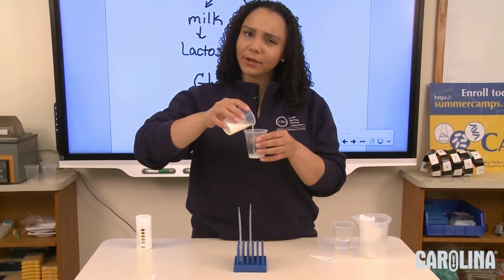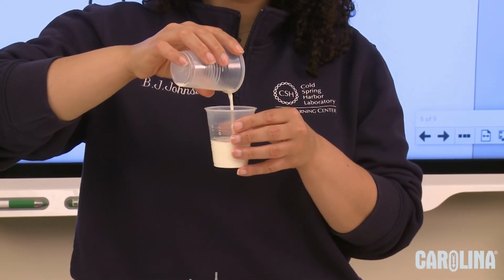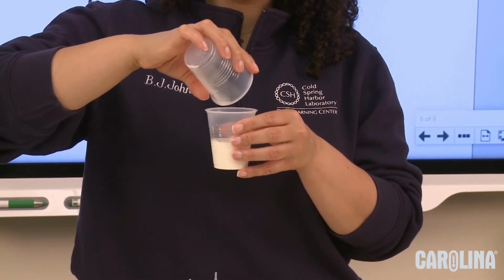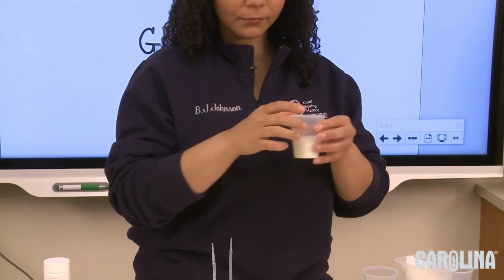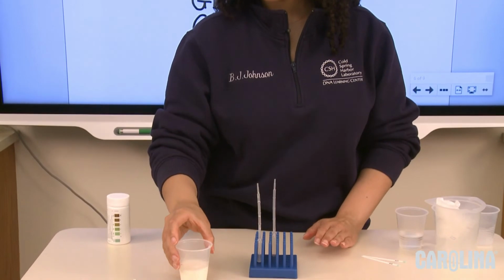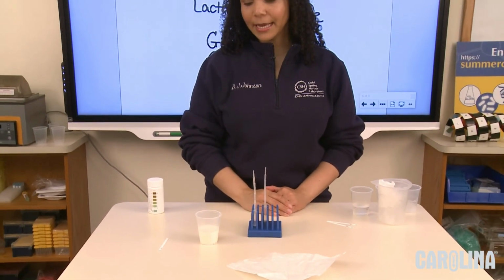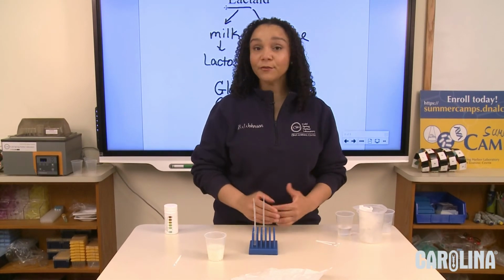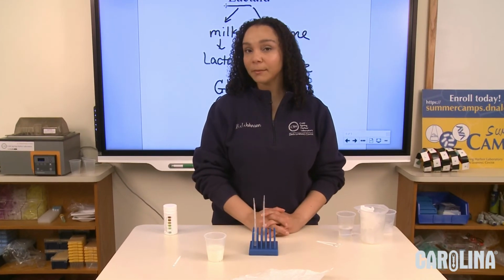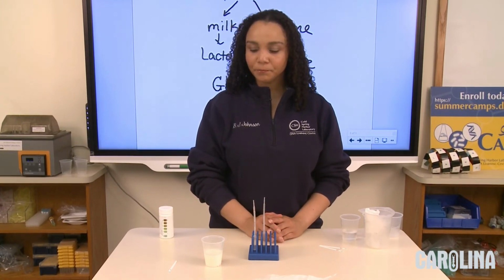Now, what do you think is going to happen after I do that? So I'm going to let it sit for about 30 seconds to let the lactase act on the lactose in the milk. If you've downloaded our worksheet from the website, you can write down your data on that worksheet.